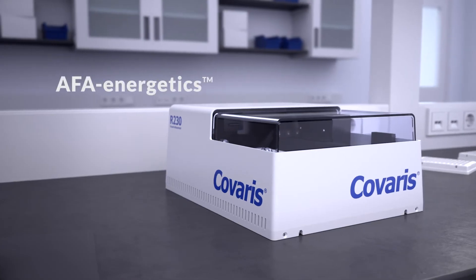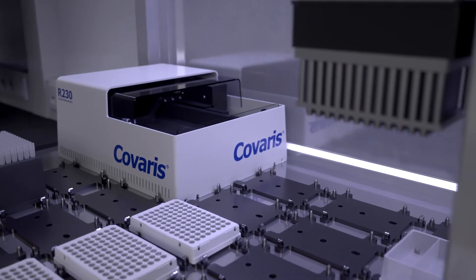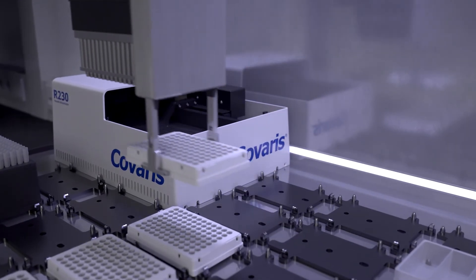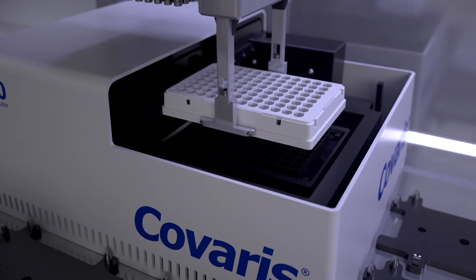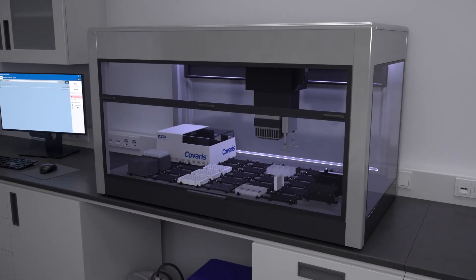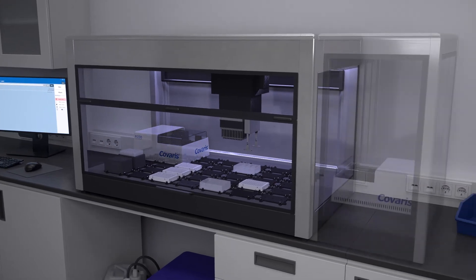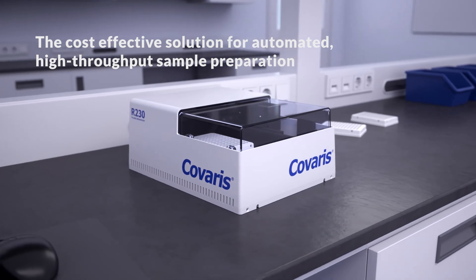The R230 provides the gold standard AFA energetics technology in a scalable, automatable platform for high-throughput workflows or iterative workflow development as a standalone system. On bench or on-deck, the R230 focused ultrasonicator is the ideal sample processing instrument to future-proof your lab.